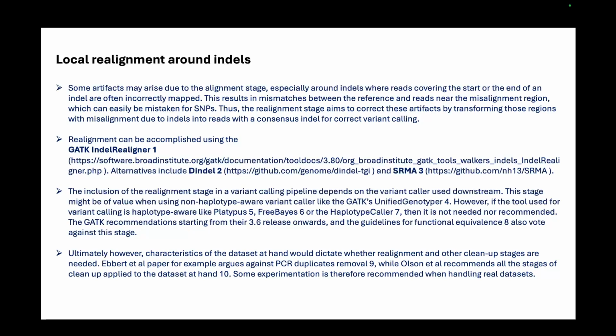It depends on what software you are using, so check the documentation and what they're saying. Basically, process your data in coherence with how your software actually expects it to be. So it is always better to look into the software and check if it requires it or not, because it will always mention things like that.